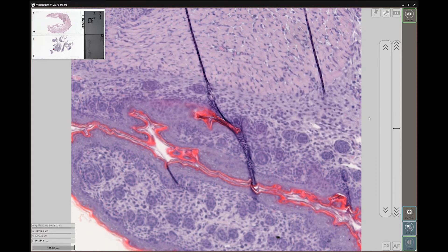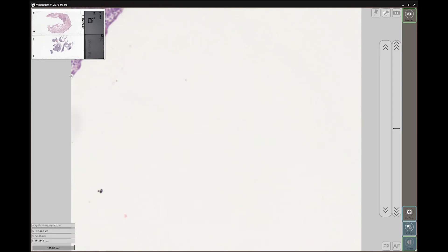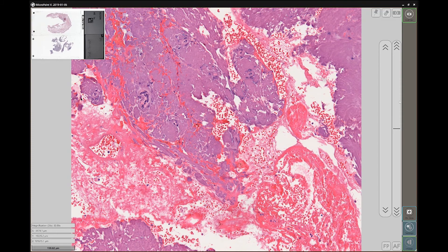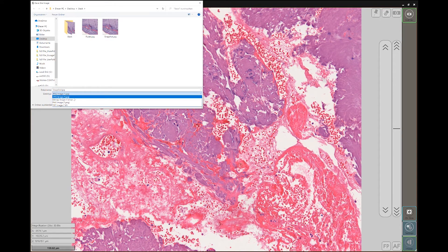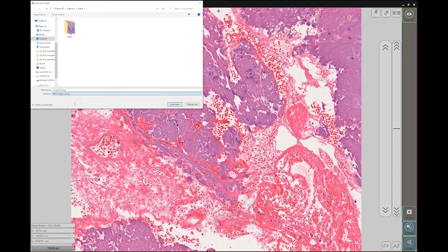The last feature that we will cover is the snapshot. In the upper right corner, next to the Z stacking button, the camera-like icon will allow you to take a screenshot of the whole viewport. You can save your screenshot as a TIFF, JPEG, PNG, or BMP.